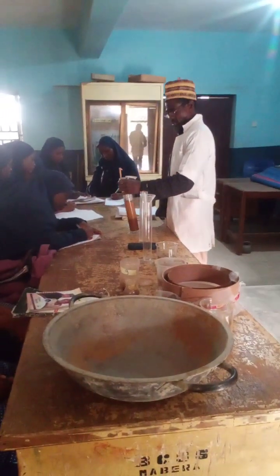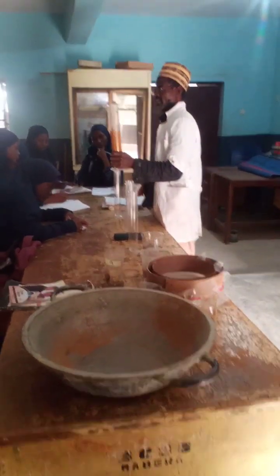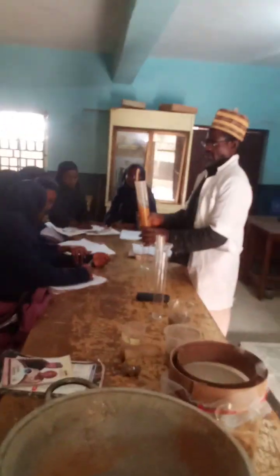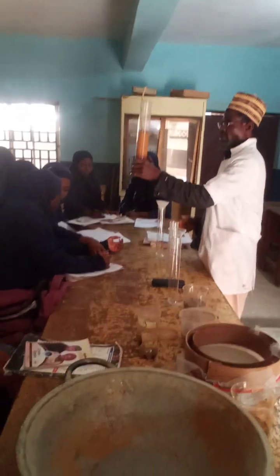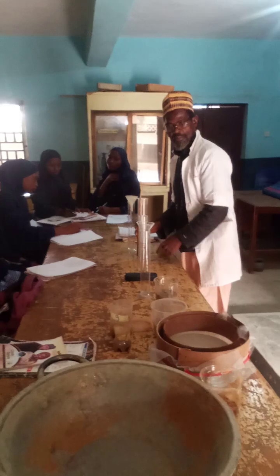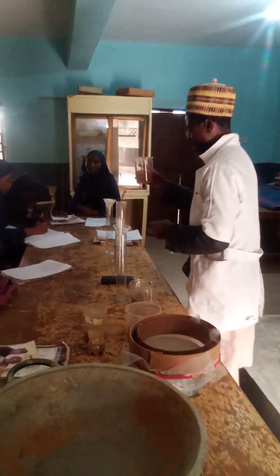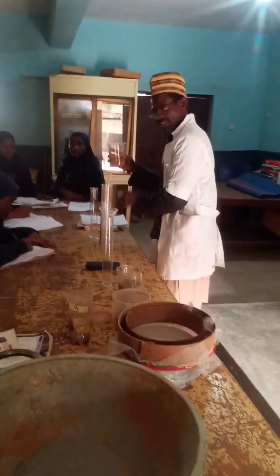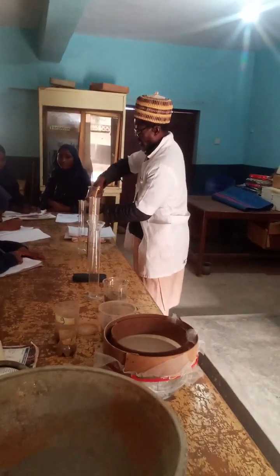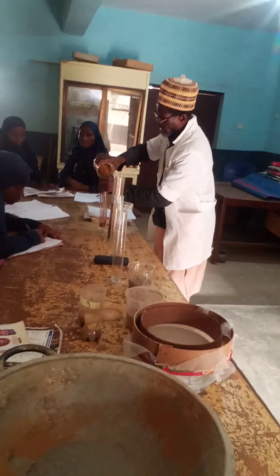So in the sedimentation method, we need an equipment called a measuring cylinder. Then the procedure goes thus. This is a measuring cylinder. You take a sample of soil, then you pour it inside the cylinder. Mix it thoroughly and pour it inside the cylinder, as thus.